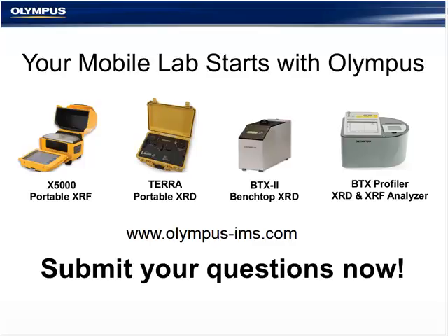Yes, all of our instruments have a cooling fan that takes care of any electronics needs, such as circuit boards, etc. The detectors themselves have a Peltier cooler, which is independent of that cooling fan. So ambient variations should not bother the instruments at all.